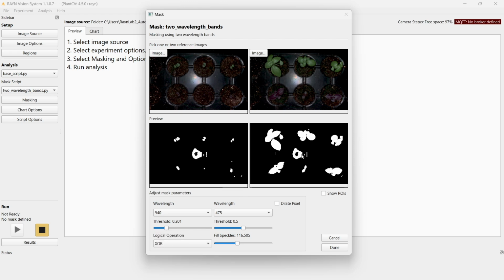Yeah, here we go. So what the XOR does, it basically cuts out parts. And by this, we can decrease this artifact in the middle, because the reflection of blue usually is not that strong with plants, but it is in areas where we have a general high reflection. So that's what we can do right here. Here we go. So we could basically almost completely remove that. Let's see. A little bit more. No, actually, I think it was quite fine like this.